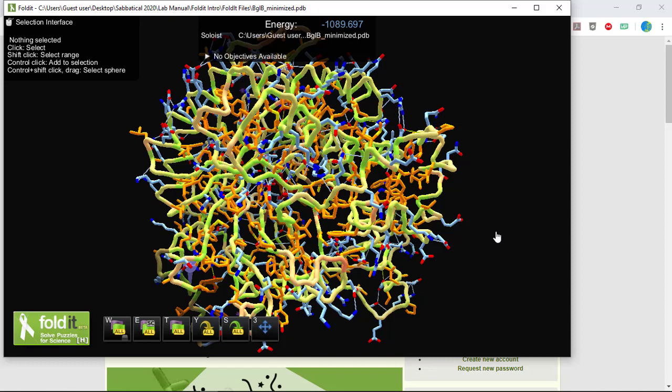Just as a reminder, in those condensed views, carbon atoms aren't shown, but they are implied at every corner and end of line. And hydrogen atoms aren't shown at all. We just know they have to be there to satisfy carbon's valence. In the Foldit structure, we see that same condensed line angle representation of the side chains. Since we selected CPK in the view options, important bonding atoms of the side chains are color-coded for us, with nitrogen colored blue, oxygen colored red, and sulfur atoms colored yellow. The carbon atoms of the side chains are not colored in, and none of the atoms are color-coded in the backbone, only in the side chains.